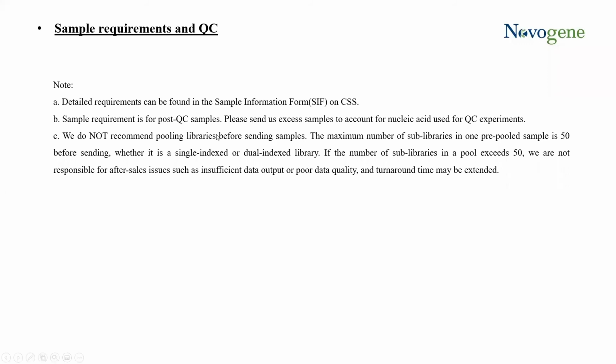Now, given that our QC requirements are around, for example, say 0.5 nanograms per microliter, we do tend to ask that you send more. This benchmark that I gave previously is for our post-QC samples, meaning that, yes, it meets our qualifications, but there may be potential for human error here. You might have a run stop. The power might go out. So we'll need more of your material to get the quoted data.